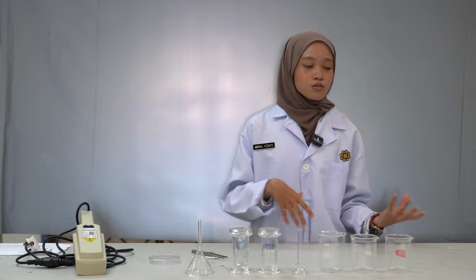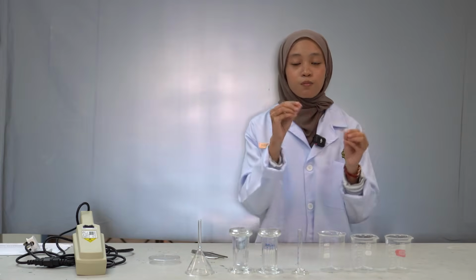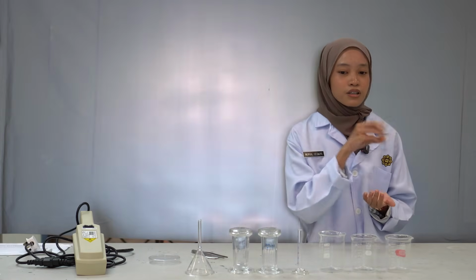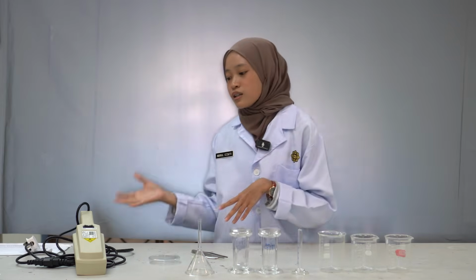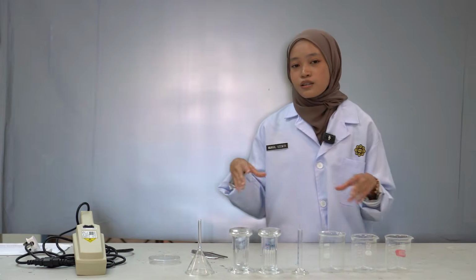So they still use a TLC plate, spot the reaction mixture every hour and run it, and they can see the real-time progress.